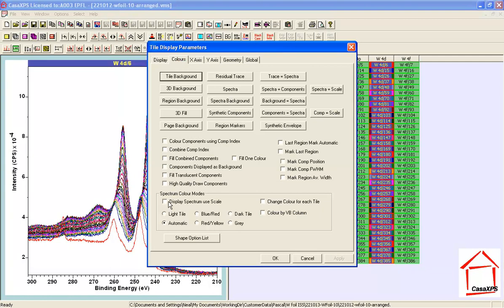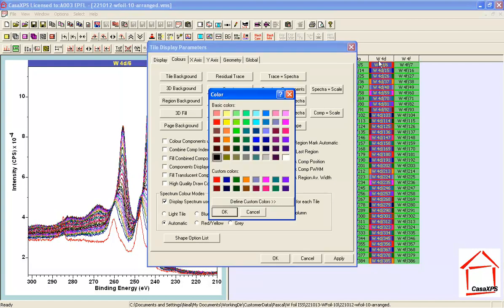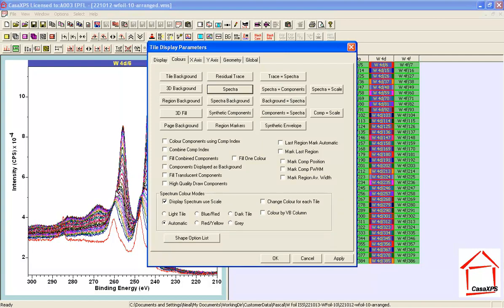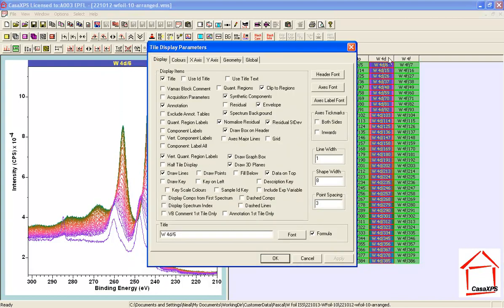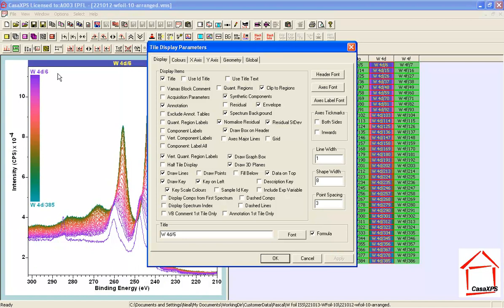I will also plot the data using a colour scale. The colours used at the moment are just a repeating set of 16 custom colours, which doesn't give any impression of how the data evolves from one state to another. I would like to see how the oxide moves progressively through to the metal, so selecting one of these colour scales and pressing apply alters the colours. I can also display a key scale on the left-hand side, giving a colour scale that matches the display and shows the evolution from oxide through to metal.